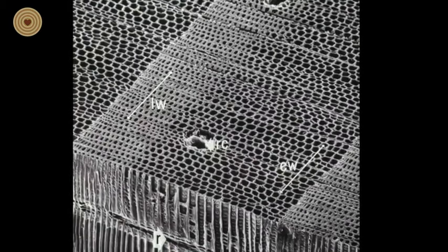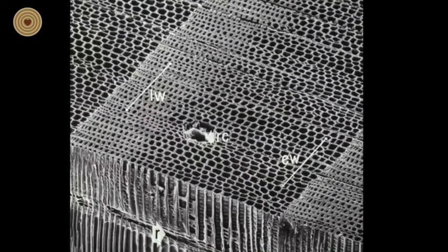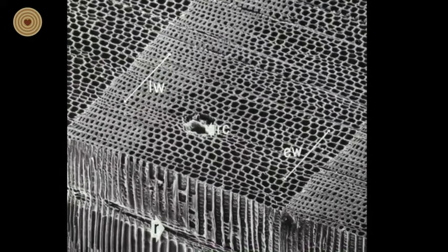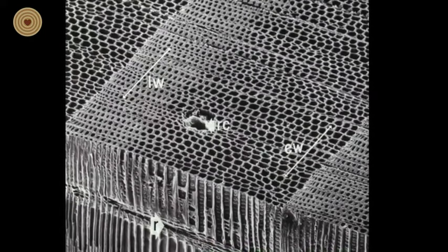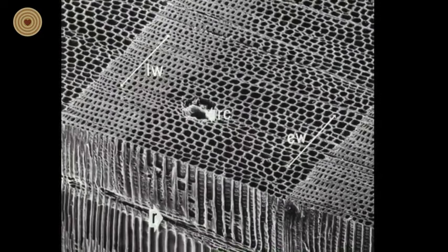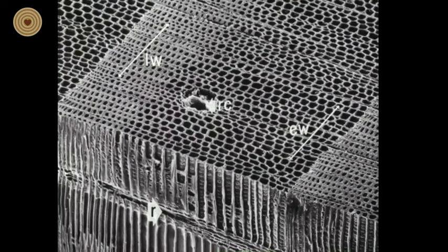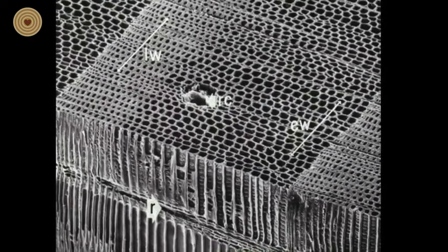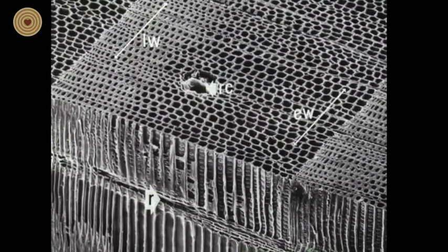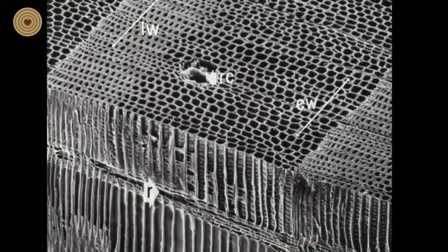If we start with a softwood block, scanned here at a relatively low magnification using a scanning electron microscope, we can start to see some of the wood microstructure. It is important to note the different orientation of the cells. Most of you are familiar with the end grain of the wood, which we would call the cross-sectional or transverse surface. Here the end grain is shown at the top of this piece of softwood.